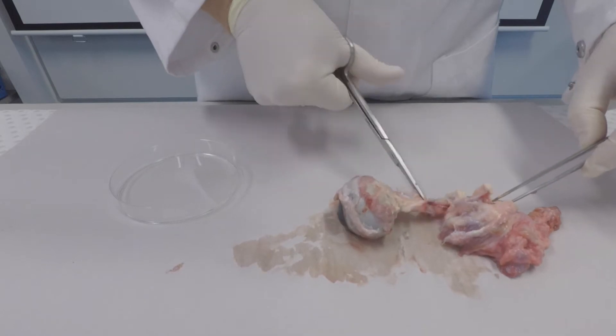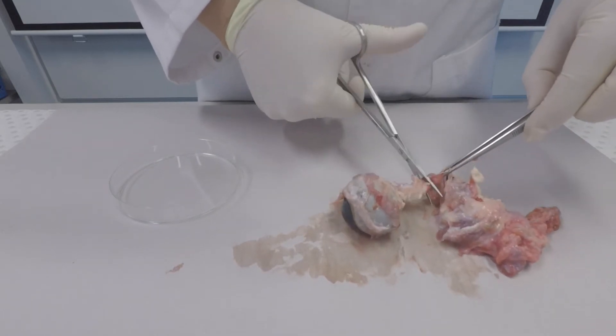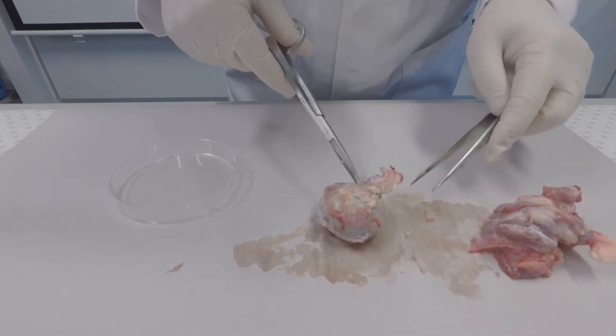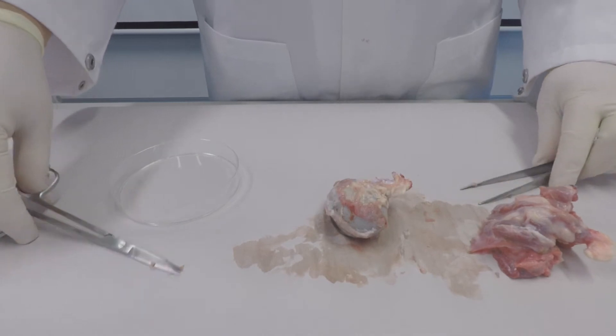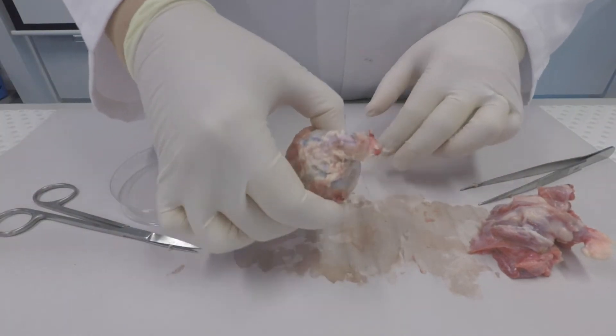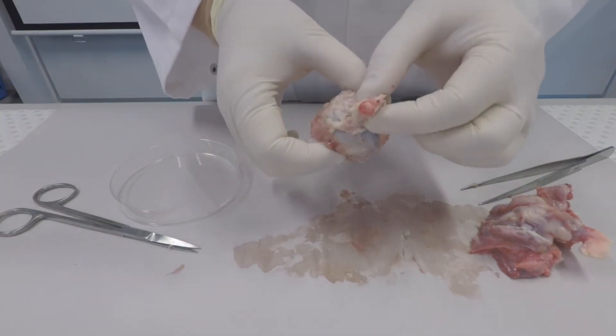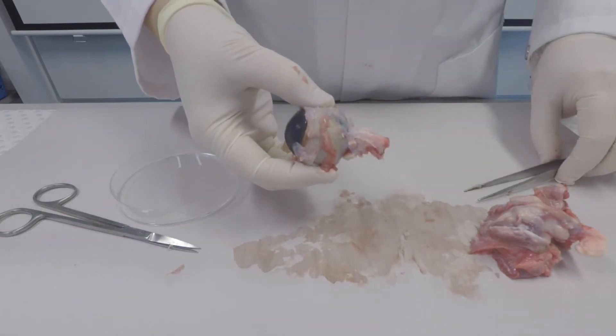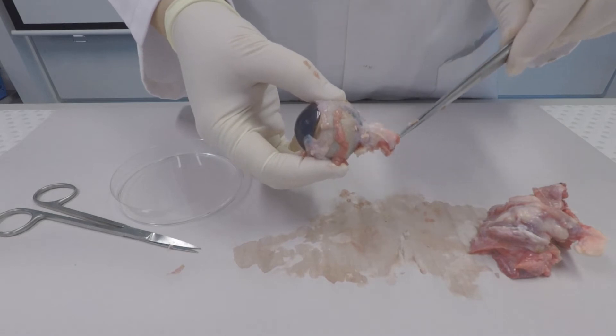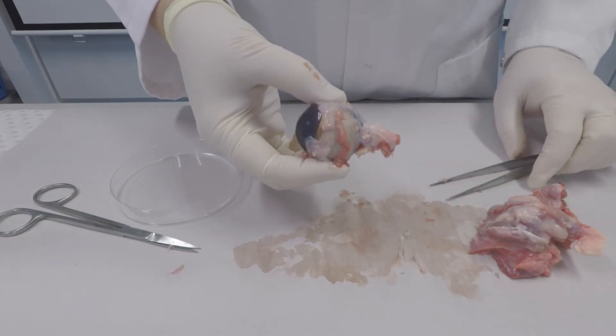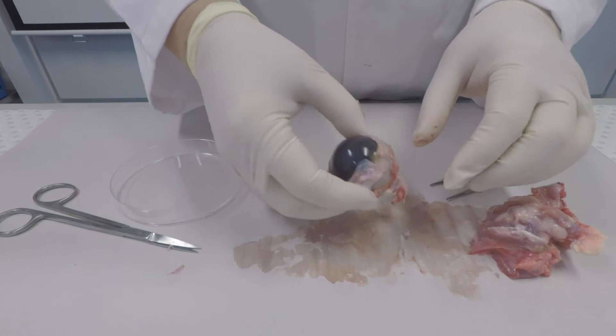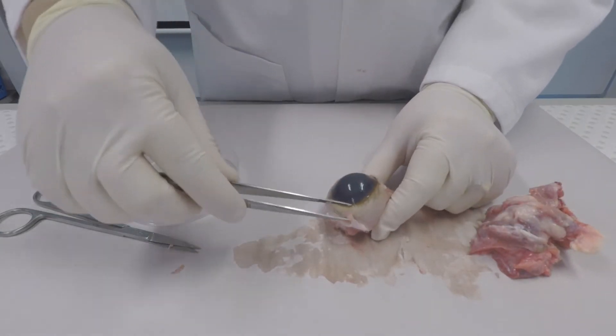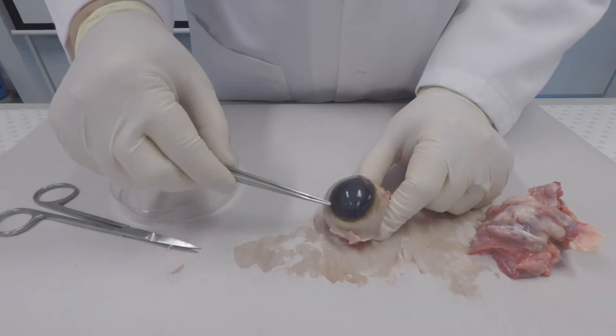I'm trying to remove the fatty tissue and remaining muscle tissue to show you the optic nerve. The optic nerve is a cranial nerve. It captures visual sensory information and carries it to the brain.